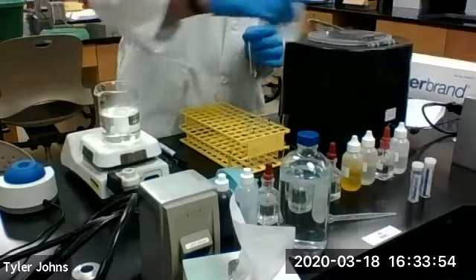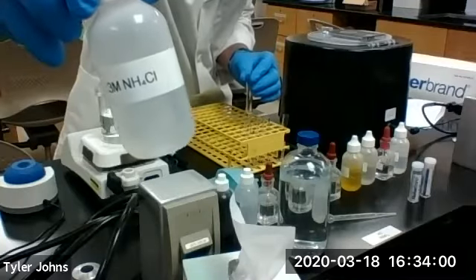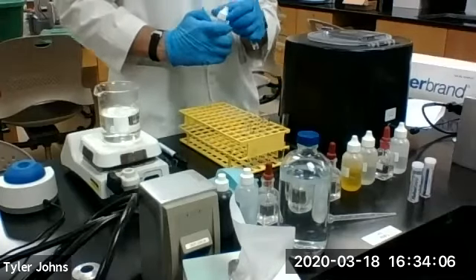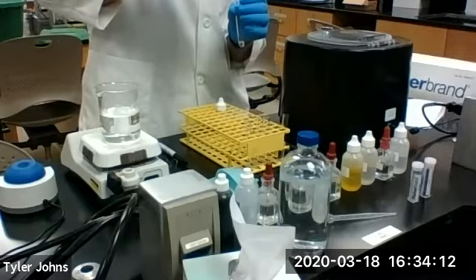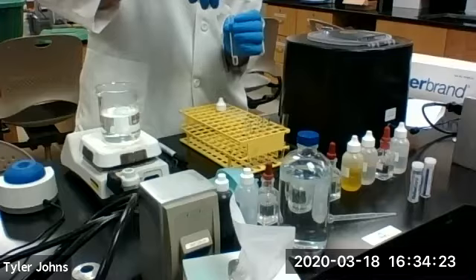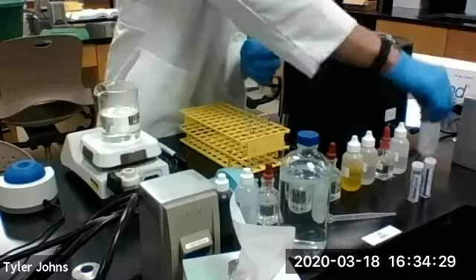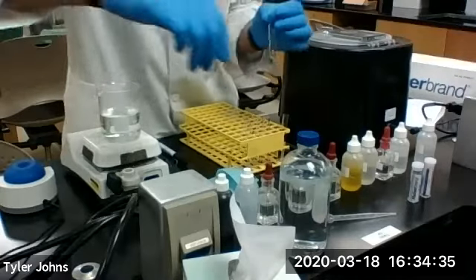Next, we're going to add 1 ml of 3 molar ammonium chloride. And we're going to add 2 mL of deionized water.